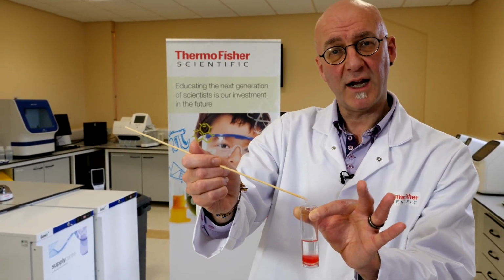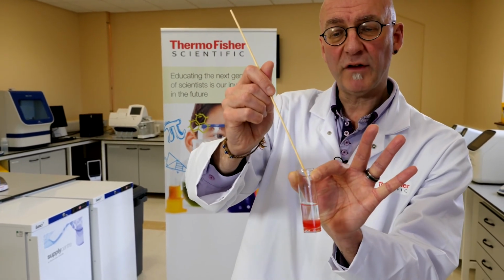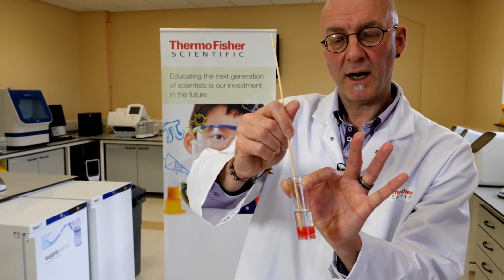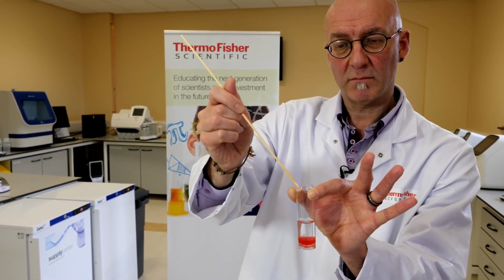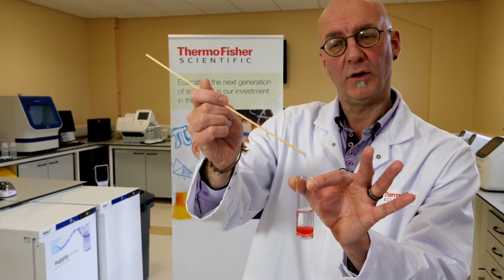But there we are. We've extracted DNA from strawberry. You can see that on the end of my stick. As you see now, because I pulled that DNA away, even more DNA is being produced, and I can keep spooling that pretty much all day long until all that DNA in that solution is out and on the end of my skewer.